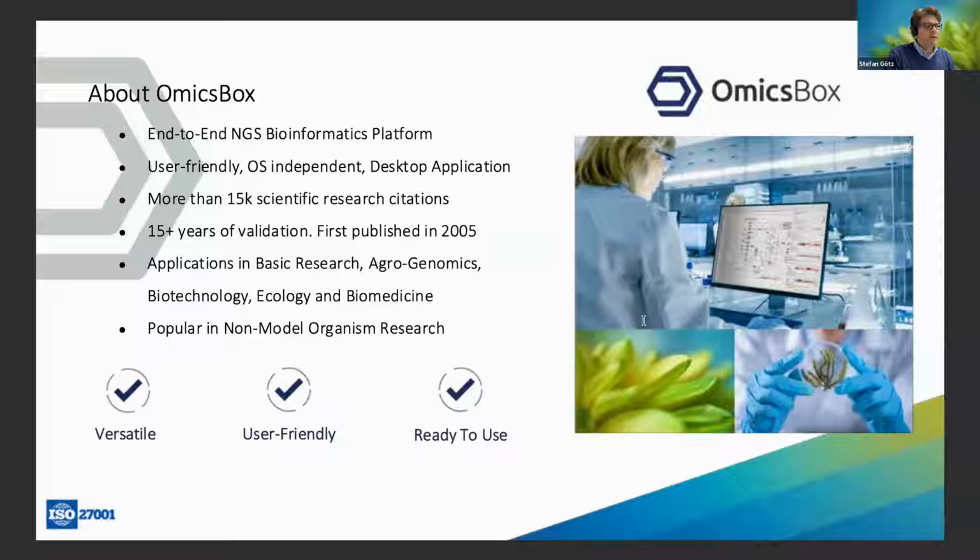And this means a lot of non-model organism research is being performed with OmicsBox, because you don't need those previous functional knowledge to work with the platform, and whenever you're coming with something strange or something new or something off topic, you can basically load in all the resources you need within OmicsBox, and then can do all the complex data analysis as well with the platform. So versatile, user-friendly, and ready to use to go end to end.